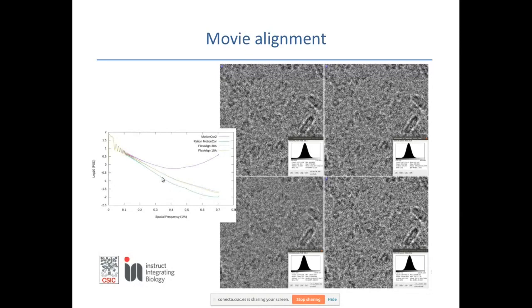We think that this might be related to the final interpolation, but we don't have clearly the reason for that. But again, do not believe blindly any program output. It might have attenuation at high frequencies because of some interpolation, some particular problem like this one of aliasing. You can also see here, it is a little bit small, but if you look at how the CTF is oscillating, you see that some of them go a little bit farther than the others.